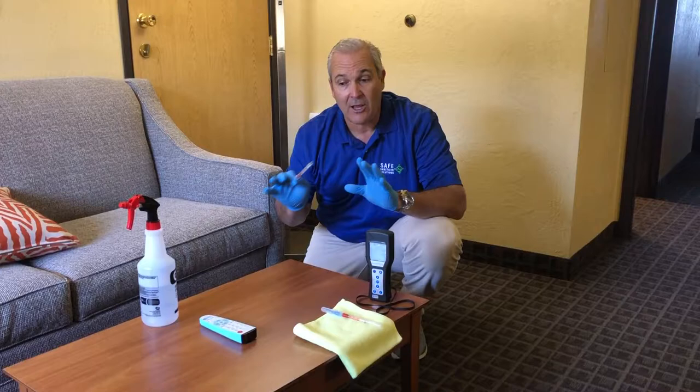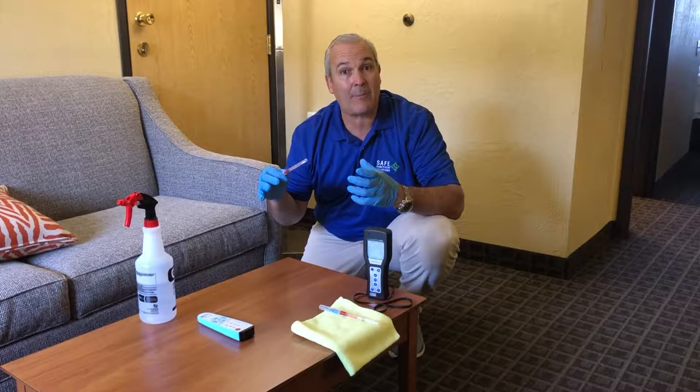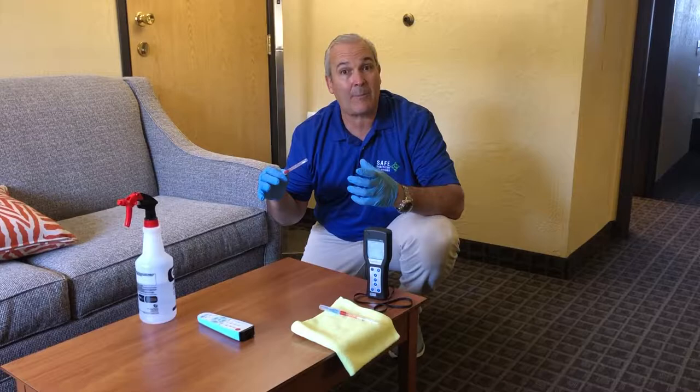I'm going to do this coffee table. The customer — the guest checked out earlier today, and the room has not been cleaned. We want to see what kind of biofilm — that gray sludge matter — the contamination that's built up in the room while the guest was here.